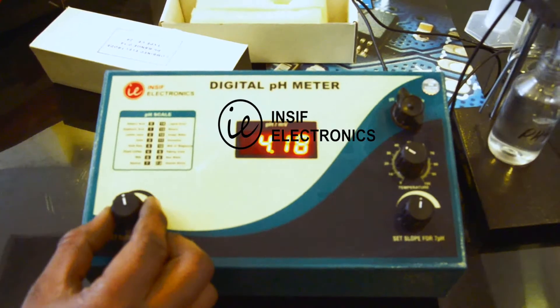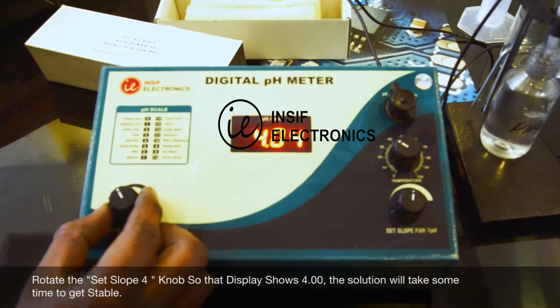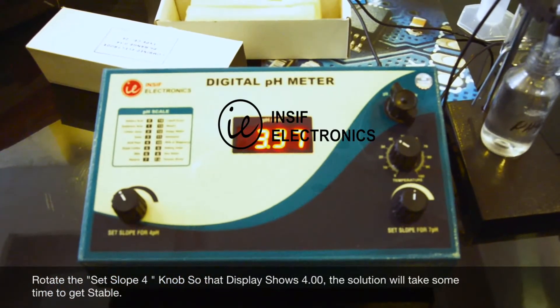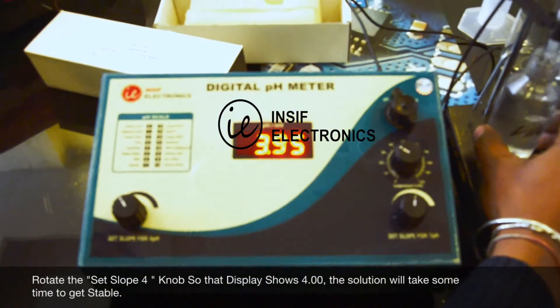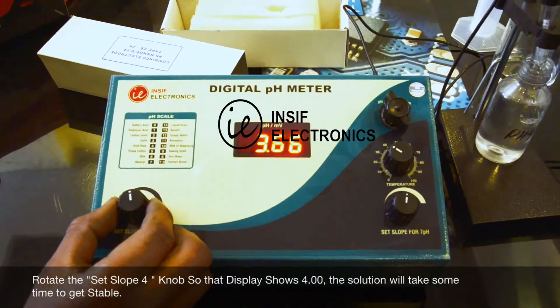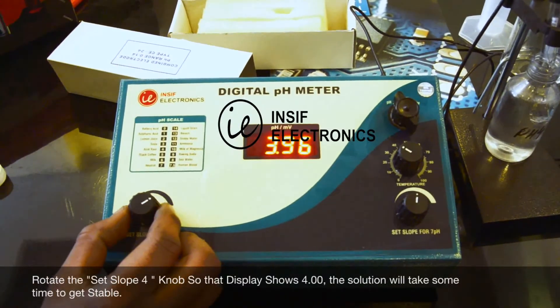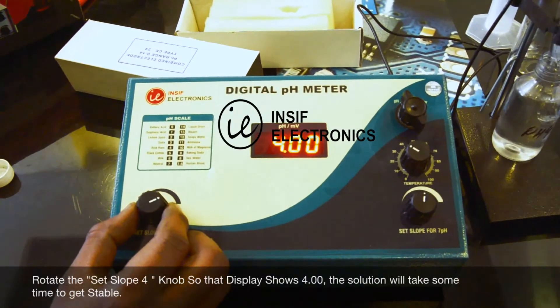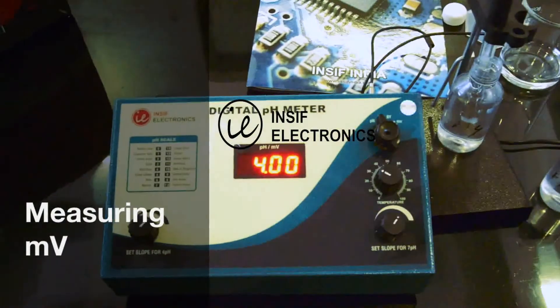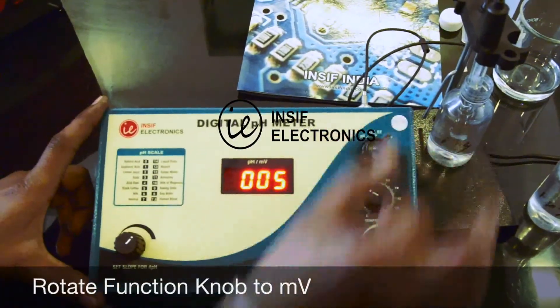Now rotate the set slope for pH 4 so that the display will show 4.00. For measuring millivolts, rotate the function knob towards mV and the display will show millivolts.